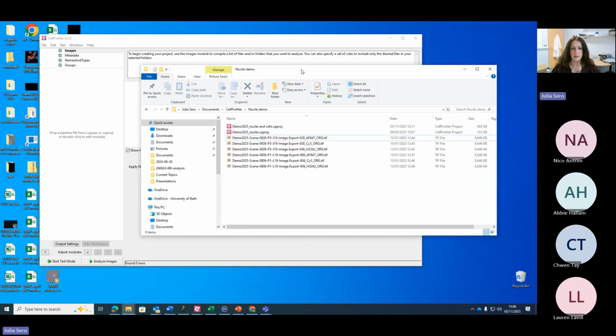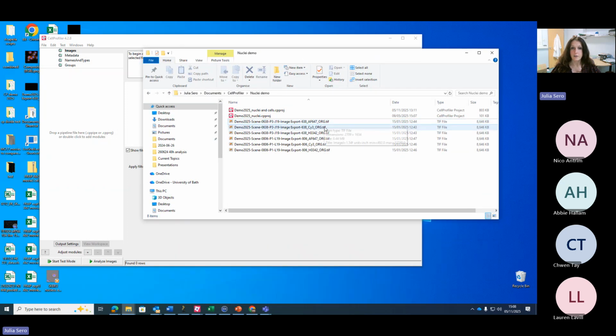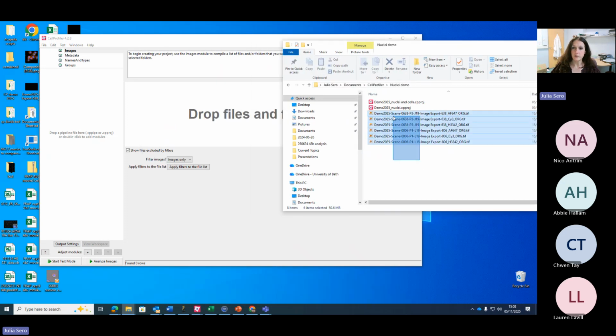Here in a demo, I have 2 sets with 3 fluorescence channels each. They've got this H3342, that's Hoechst 33342. There's a channel that's a red channel, that's got an actin stain. And here the AF647, that's Alexa Fluor 647, and that is, in this data set, labeling cells which are proliferating, so cells which have incorporated EdU, but it could be anything. So the first thing we're going to do is just drag and drop to load the files.